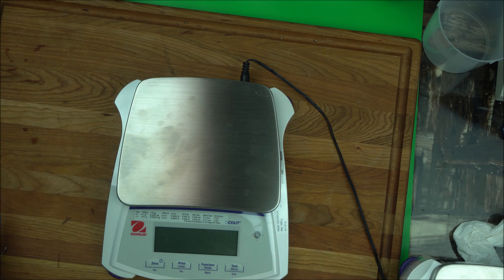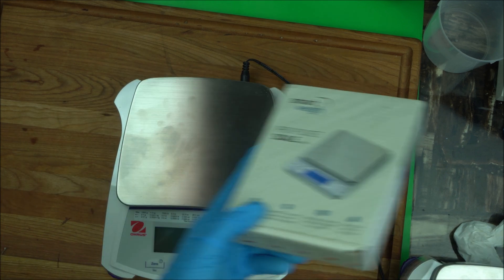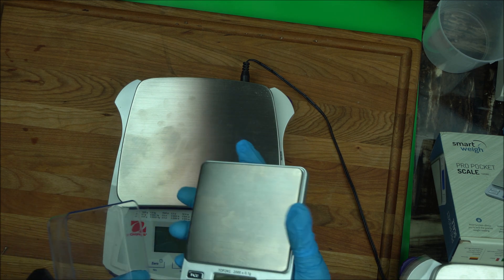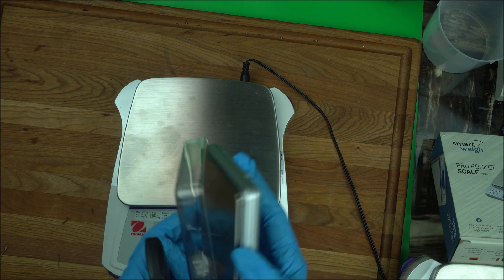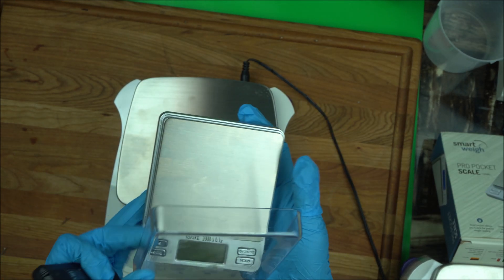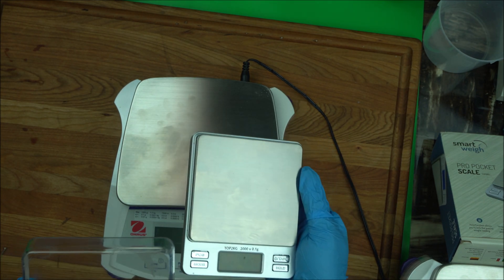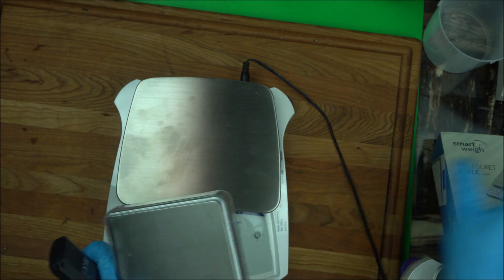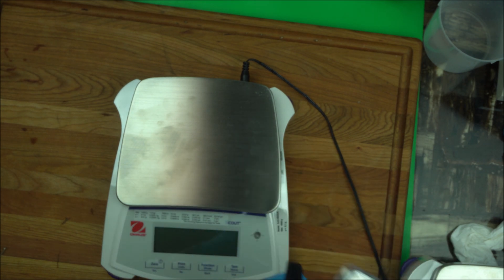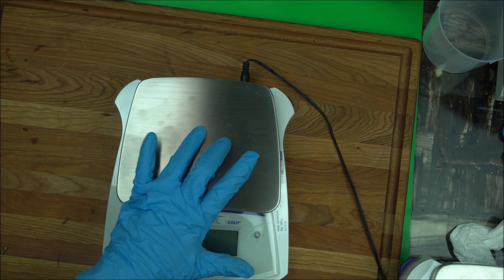What is the best scale for oil-based formulators? Do not buy pocket scales — I mean pocket scales can be any of these, please don't buy any of them. A lot of them are on Amazon. They may be accurate to a certain extent if you are lucky, but they are not the best. These are only for DIYs. If you are not really serious and just playing around, you can use a pocket scale. But this is not for cosmetic formulation.